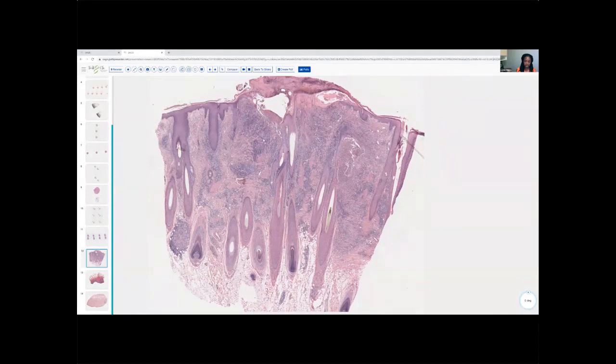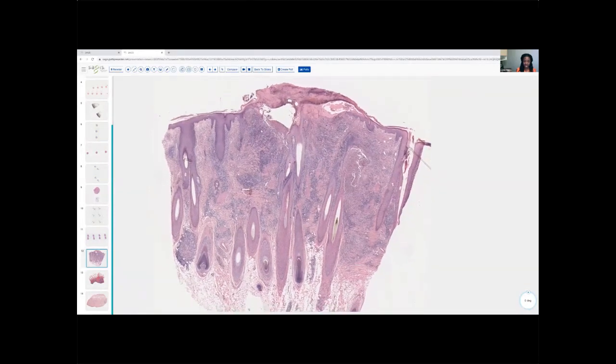This is an example of folliculitis decalvans. And so remember, with folliculitis decalvans, you have this recurrent pustule formation, these suppurative pustules, and with each flare a scarring process takes place. You end up with essentially a scarring alopecia because of this recurrent, robust inflammation. And that polytrichia, where you have fusion of the hairs, is part of that scarring process.